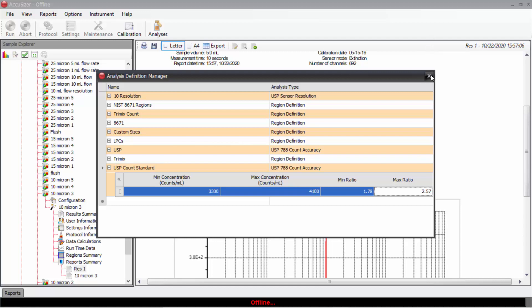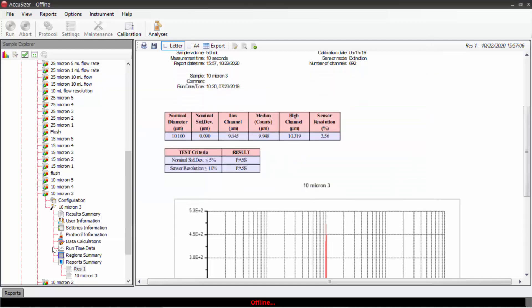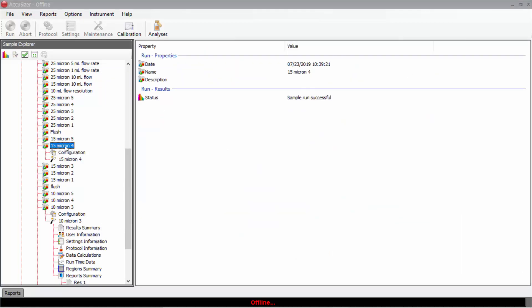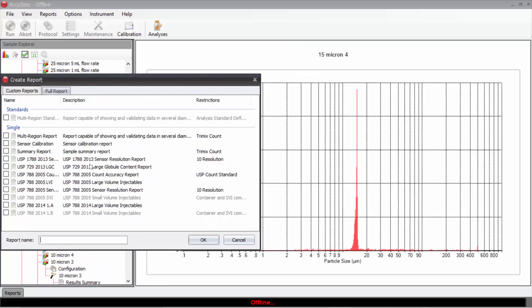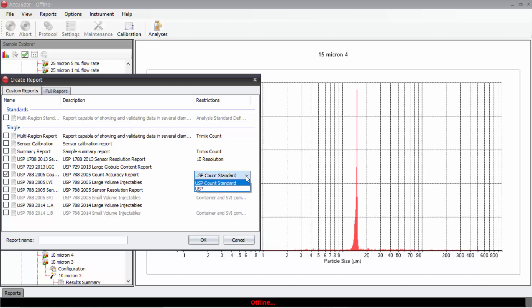So I've entered this information. Now I can take a result running the USP 15 micron count standard. I click create report. And down here I will choose count accuracy report. I have entered the information as USP count standard. Give the report a name. Click OK.